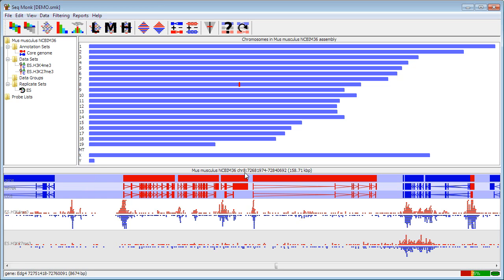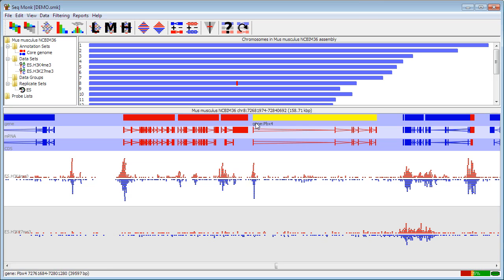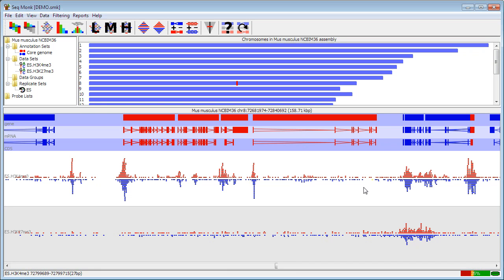The chromosome view itself is a track based view and you can change the tracks of information that are shown, either the annotation tracks or the data tracks. Again the easiest way to change these is from the toolbar at the top using these two buttons here.